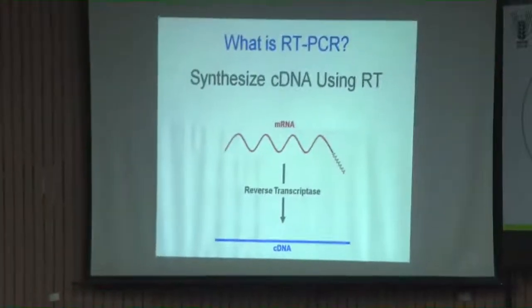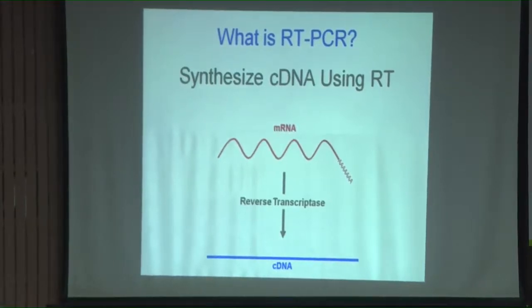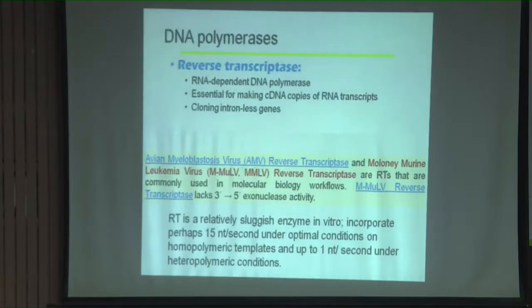Then here we talk about the analysis of gene expression by RT-PCR. RT-PCR, here we mean reverse transcriptase PCR, right. So, I am sure that by now you understand what is reverse transcription process. It is reverse of the transcription process where you produce a complementary DNA or cDNA from a mRNA, and in doing this the job is done by a particular DNA polymerase which is called reverse transcriptase. They are called reverse transcriptase because they do reverse of the transcription process, otherwise they are a kind of DNA polymerase. You might have heard about DNA polymerase.